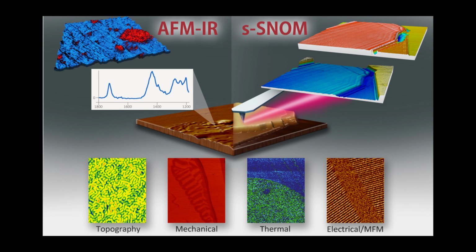Yeah, just to add to that, there is one publication by the DASI group in France where they demonstrated some AFM-IR measurements in liquid. The main challenge associated with doing AFM-IR in liquid is that the liquid adds a very large viscous damping force onto the cantilever, so it makes the detection of the IR absorption not as efficient as in air. But as Kevin said, it's something that we're very interested in and we'll continue to work on.